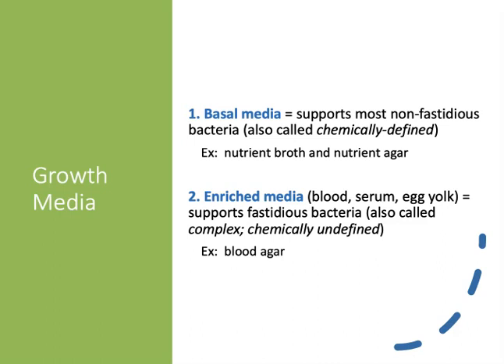Now, of all of the many hundreds of different types of culture media available to us in microbiology, we can break them down into 6 large groups. The first 2 groups are considered growth media. These include basal media and enriched media.